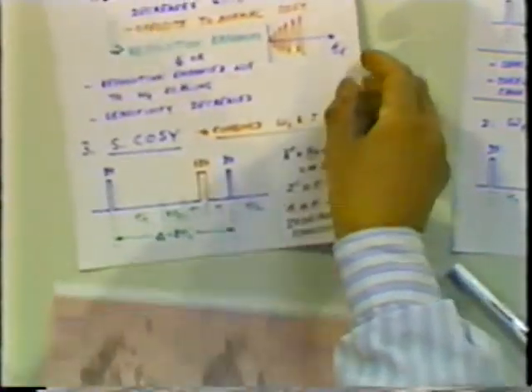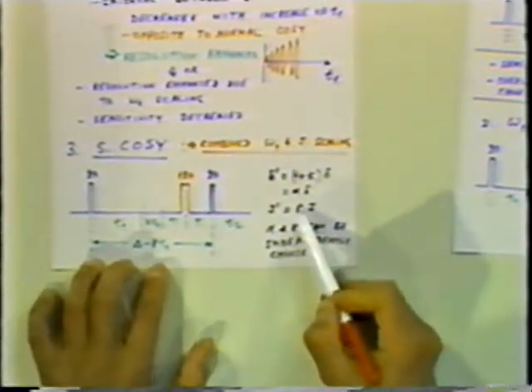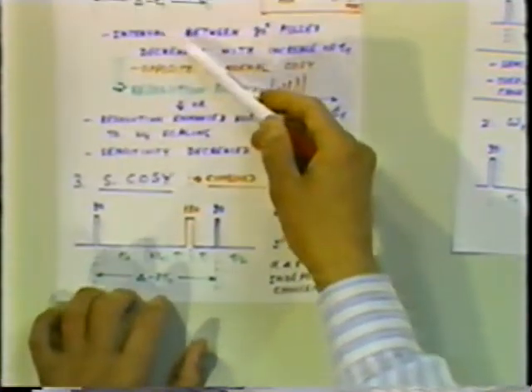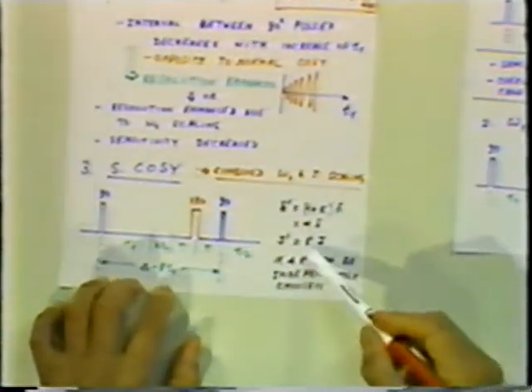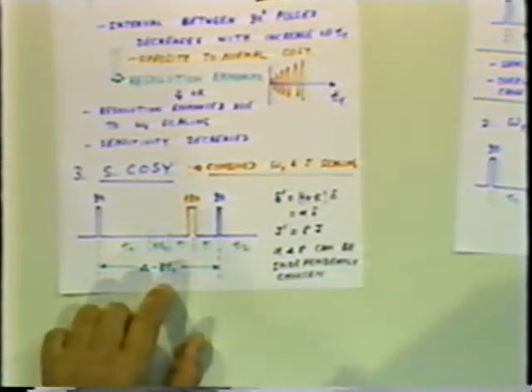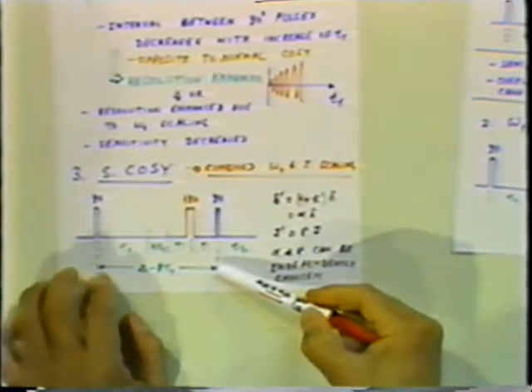As you can see very simply, in this scale COSY, if you now make, for example, your gamma as 1, then you get back to the previous scheme. But if you make your gamma equal to 0, what does that mean? That means you still have T1, but you have a fixed delta between these two pulses.